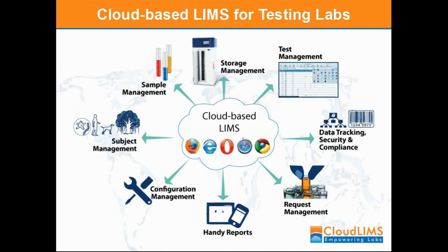These labs are also subjected to compliance such as ISO 17025, GLP, and are required to follow them in order to receive international recognition from regulatory authorities.